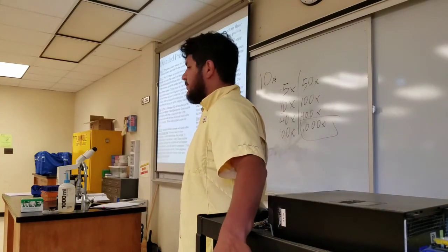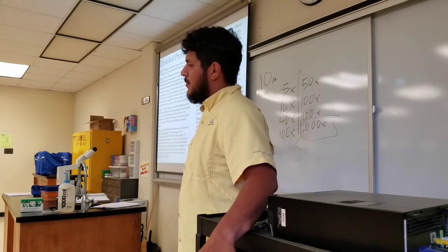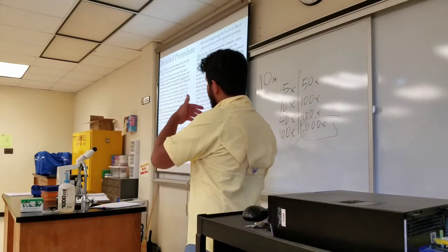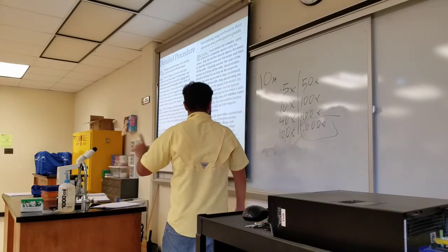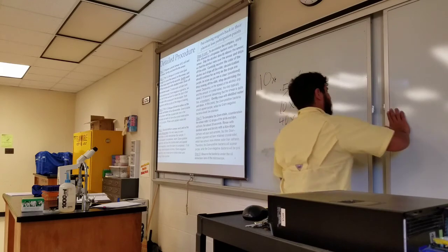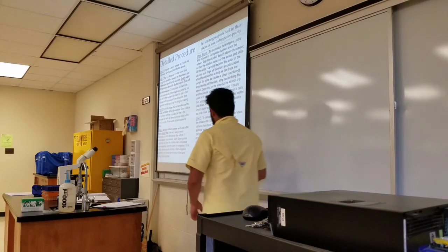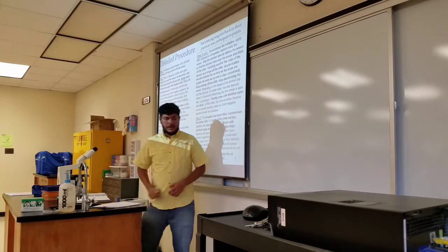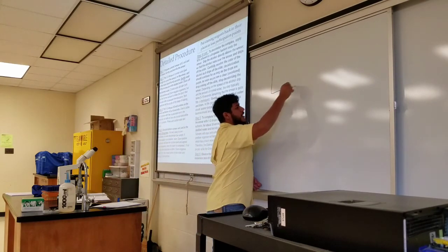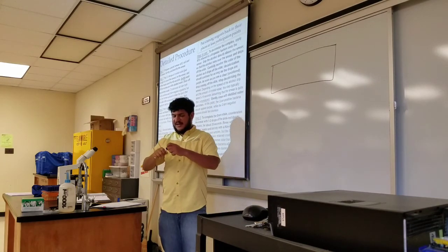This is a more detailed procedure, and I will leave this procedure on the PowerPoint, although follow the procedure in your lab manual, that's better. There's one modification that I want to clear out from your lab manual, and that's the following. In your lab manual, it asks you to do a smear, so that's for exercise 6.